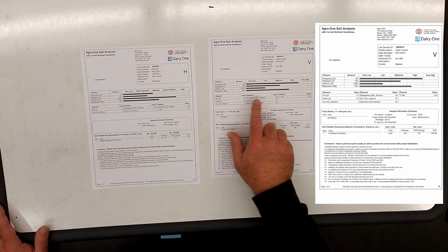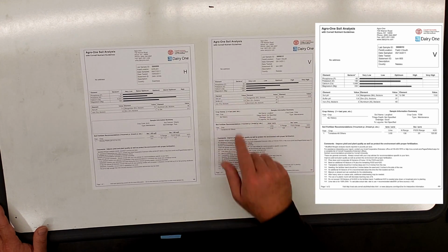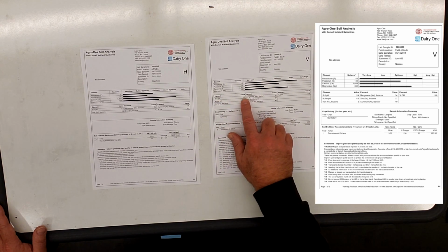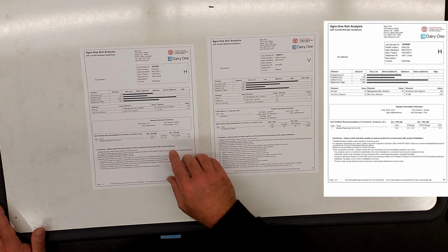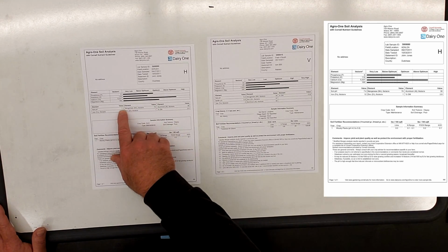Then you move farther down to this second matrix here, and there's a number of different pieces of information in here. One, and probably very importantly, is the pH. It basically gives you what the pH of this soil is. Now, for this vegetable field, the pH is basically a 5.4, which we'll talk about in a moment. And then for the horticultural one, or the homeowner's one, you see that you have a pH of 7.4.